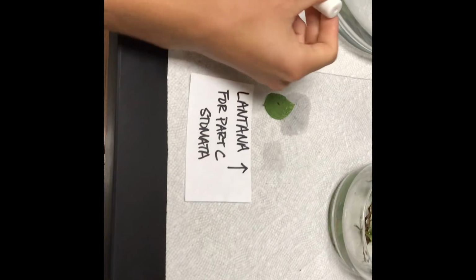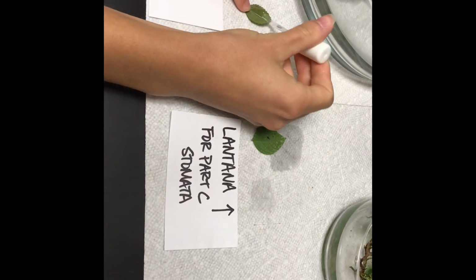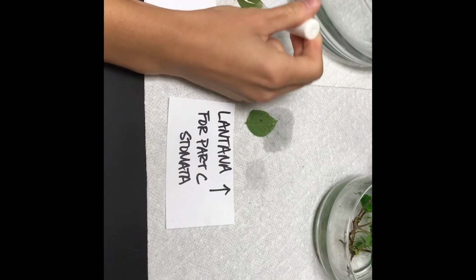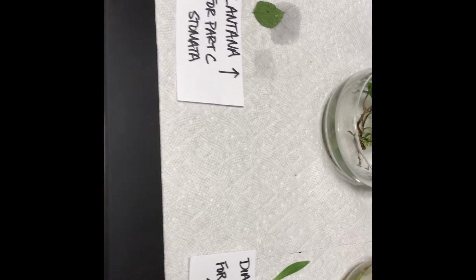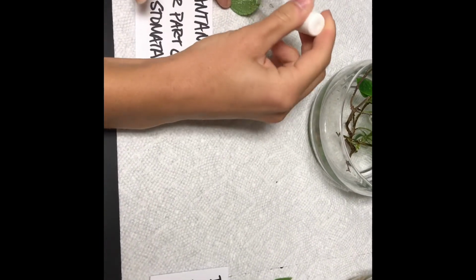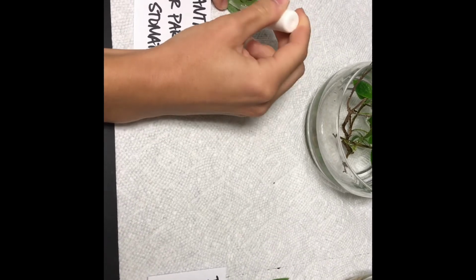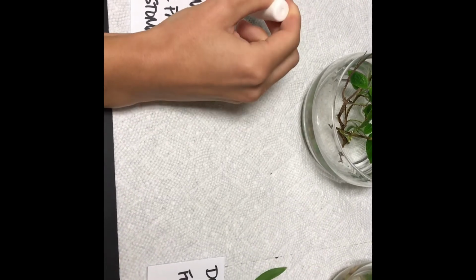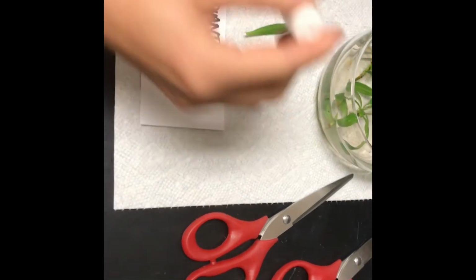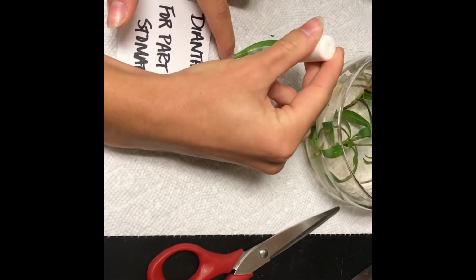Okay, so the next step is we're going to use clear fingernail polish and paint the back side of the leaves. Perfect. So that we can get an impression of the stomata. We go along, we paint them all. Perfect. And then we're going to let these dry so that we can use tape and pull off an impression of these. She's doing a great job of moving along and painting the back so we can let these dry.